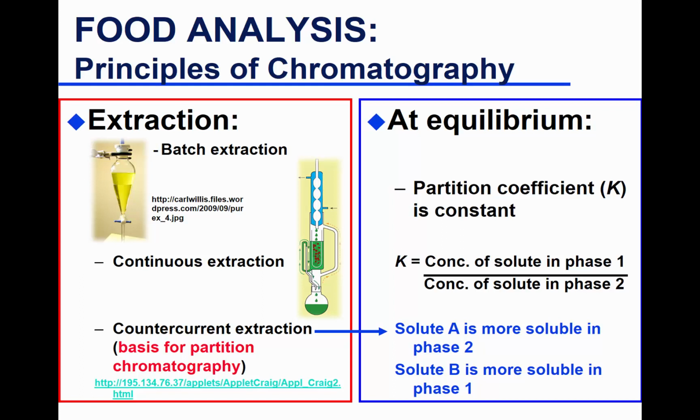Anyway, this separatory funnel, the concept of it is you use an organic solvent immiscible with water, and then you separate components that would be most likely extracted in the organic phase. And then it's a simple separation. Once you shake, shake, shake, and let it settle, and then you would dispense the aqueous that you don't care for, and then collect the organic phase.